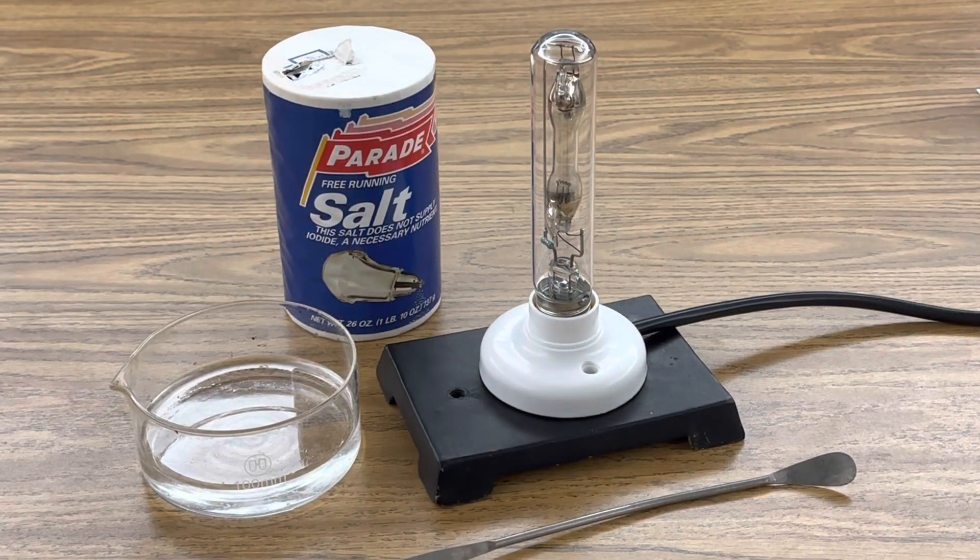For this investigation, I'm using my low-pressure sodium lamp, a spoon, sodium chloride, and 50 milliliters of distilled methanol.